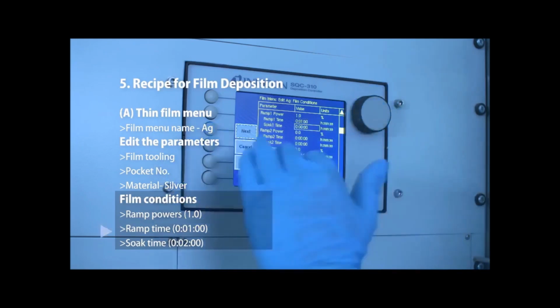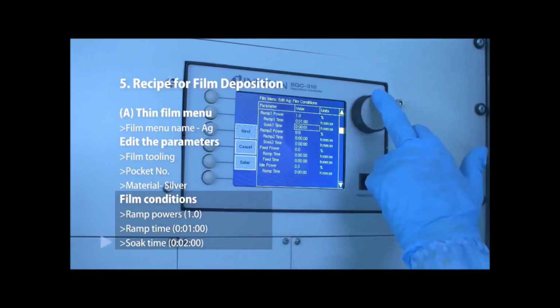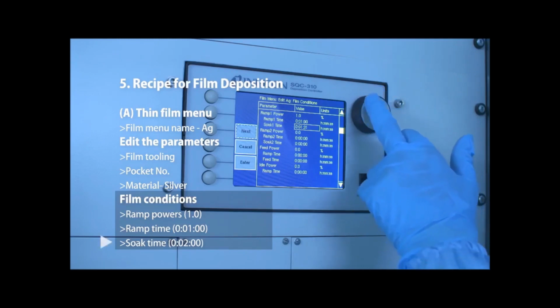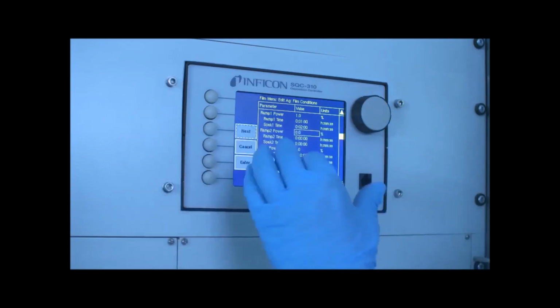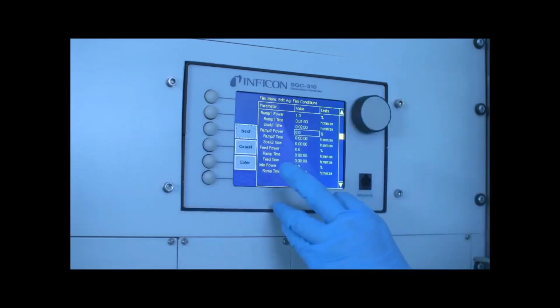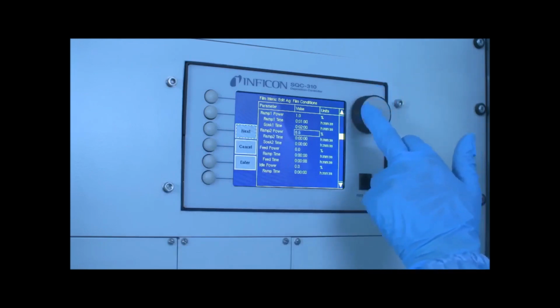And next is the soak time. Soak time is the time in which this ramp power should remain constant. So let's put 2 minutes. This soak time needs to be longer for materials having high evaporation and high melting points. Next is the ramp 2 power. Ramp 2 power should be greater than the ramp 1 power. As we set ramp 1 power to 1, let's set ramp 2 power to 2.5.